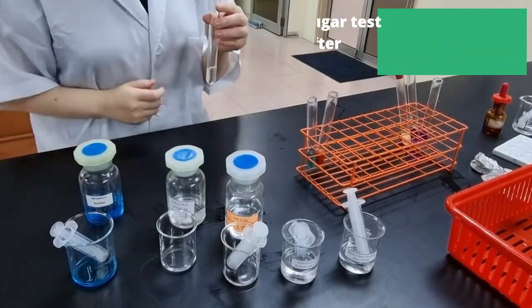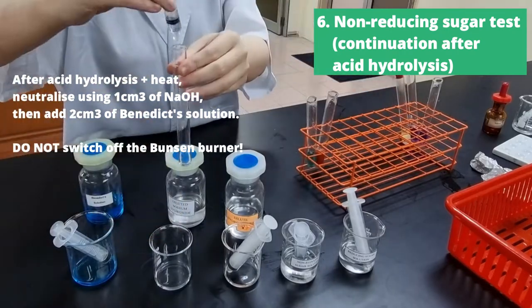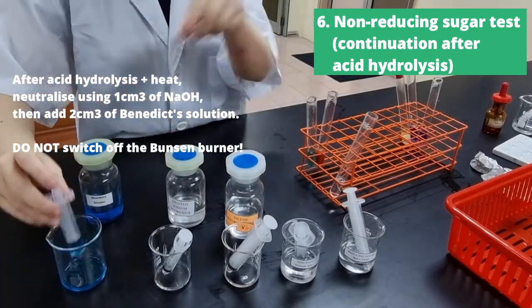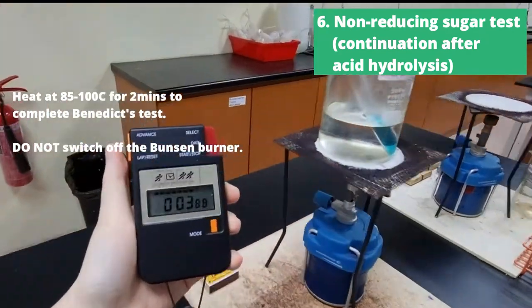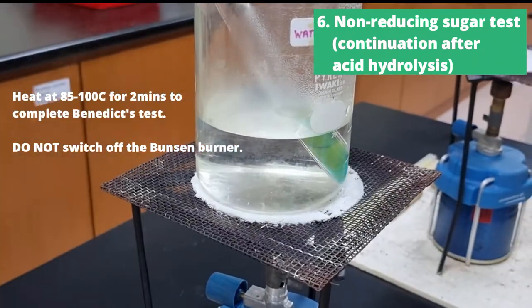Now we're going to continue with our non-reducing sugar test. We did acid hydrolysis already and heated it. Now we're going to neutralize it using 1cm³ of NaOH — sodium hydroxide — and then add 2cm³ of Benedict's solution, and then we're going to heat it again for two minutes to complete the Benedict's test.